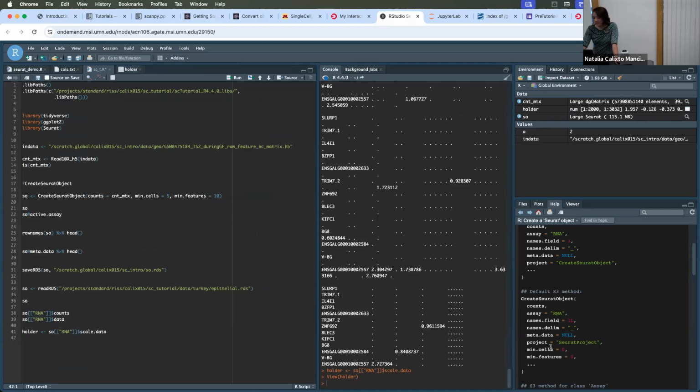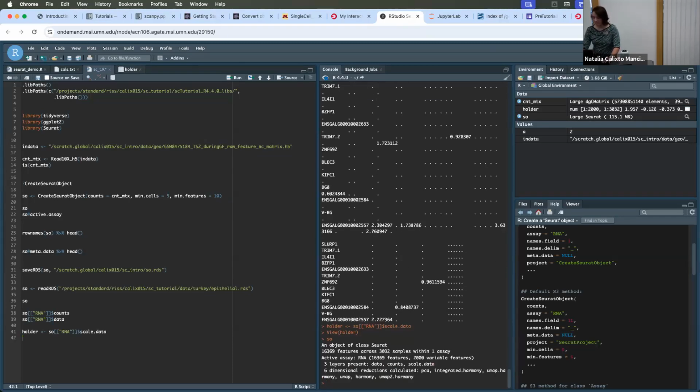And then the dimensionality reductions that are here are the things that are used for plotting. So if you wanted to do, for example, something that comes up usually in the papers of this object, then you could use the DimPlot function, and you can tell it to use a particular reduction. I'm going to use the reduction that is the later one, the last one that I used.